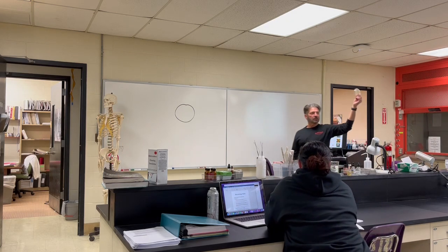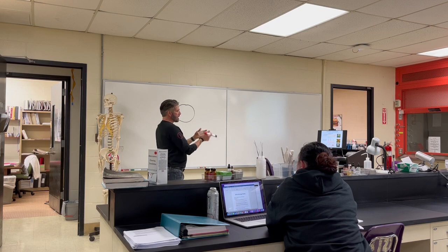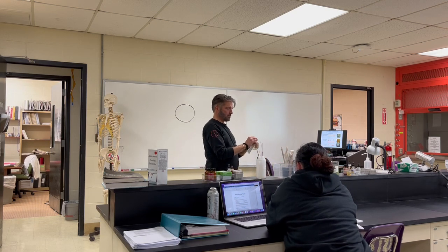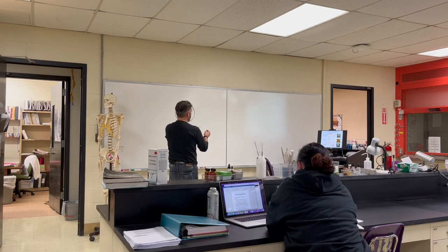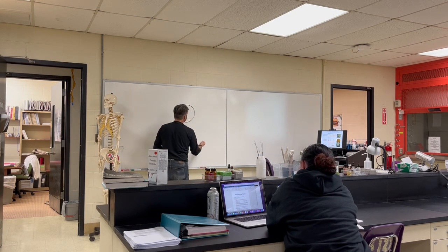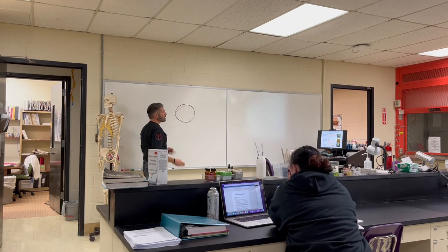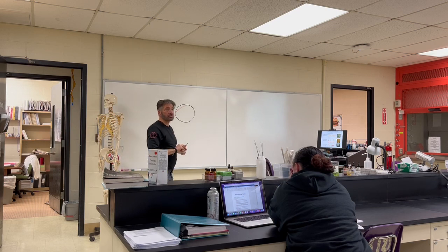So in theory, here's the plate. I'm going to take the cover off. It's sterile. Well, now it's not. But I'm going to take something on here and swab it. Let's just say I swab it like this. So I just swabbed that plate. How many bacteria do you think I just put on there? Tens of thousands. 10,000. That sounds good.